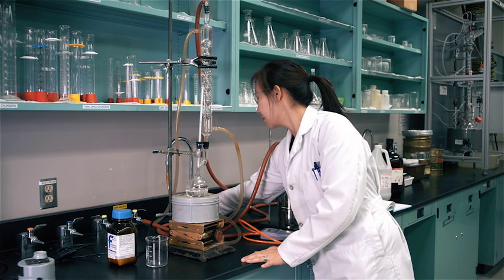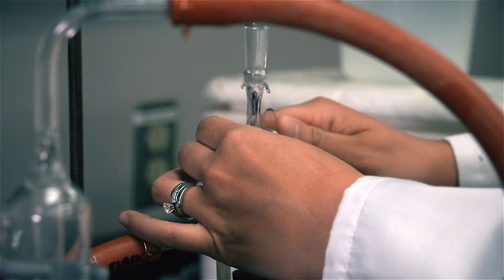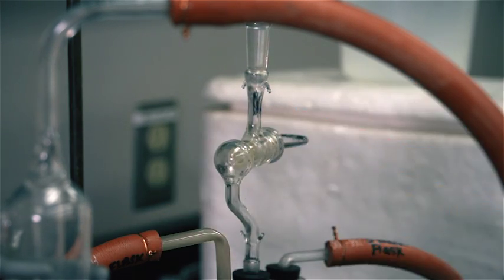Start water circulating through the condenser. Seal the system by closing the stopcock on top of the safety bottle.